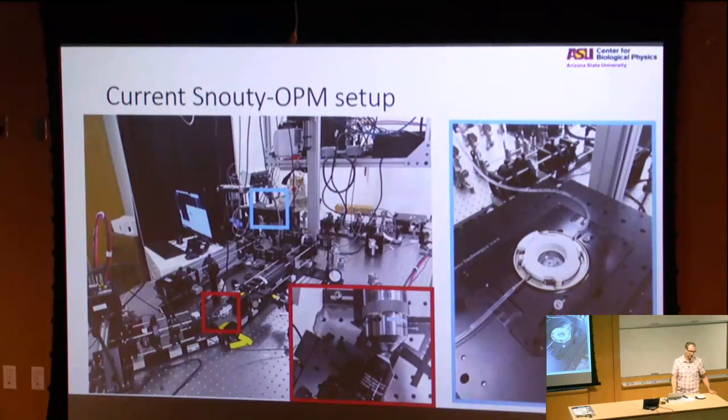I think people call this LSI light sheet microscopy, and they've tried to do this. They've actually combined it with SIM as well to do it even further. I totally agree. There are a lot of what are called multi-view reconstruction methods, which are like the poor person's version of tomography, right? So you just have one or two views, and then you basically try to fill in a bit of that missing cone information that way. Absolutely, it's possible. In our case, it's because of the constraints of how we want to handle the samples that we've gone to this geometry. But absolutely, it's possible.